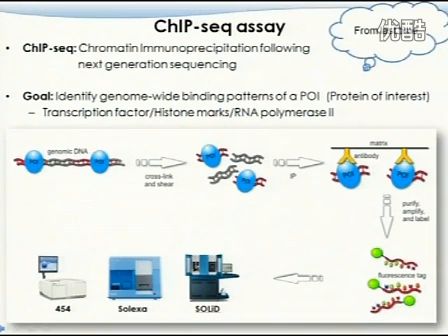So you can see this is double-strand DNA with protein bound on it. The first step is to do the cross-linking. These steps are important because we are going to use this information this time when we talk about how other people design algorithms to identify the binding sites.